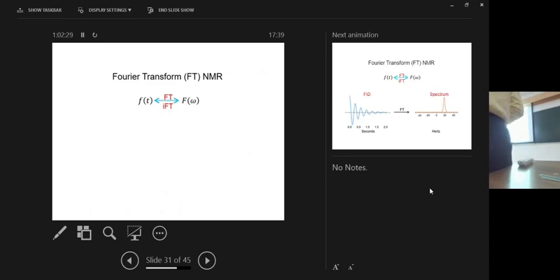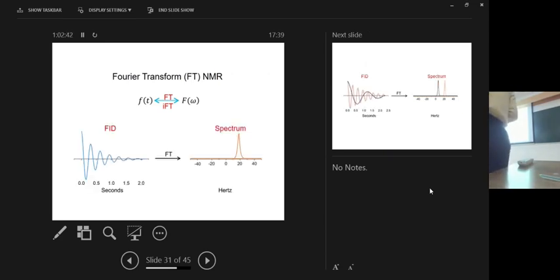And that is the principle of Fourier transform NMR. You have the signal which comes as a function of time in the detector, and you Fourier analyze it, you get the frequency domain spectrum, you have the analysis done. Okay. So that is what is indicated in this slide. This is the so-called FID, the signal which contains contributions from all the frequencies which are present. If you have one frequency present here, you will have one line present here. Notice the signal decays with time, and that is because the phase coherence decays with time. The phase coherence decays, and that's why this transverse magnetization decays here.